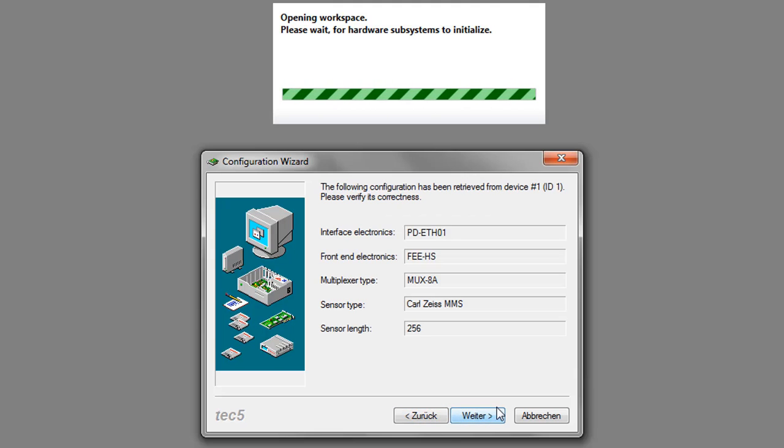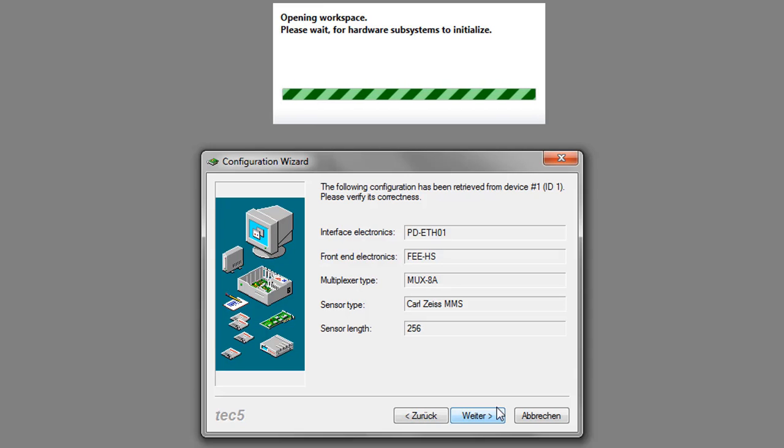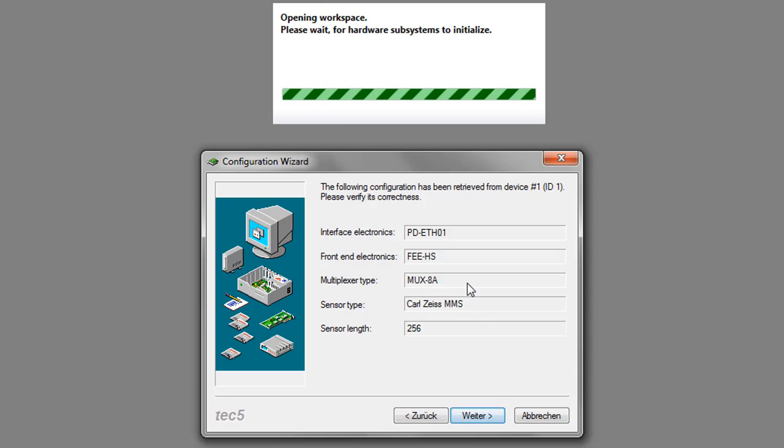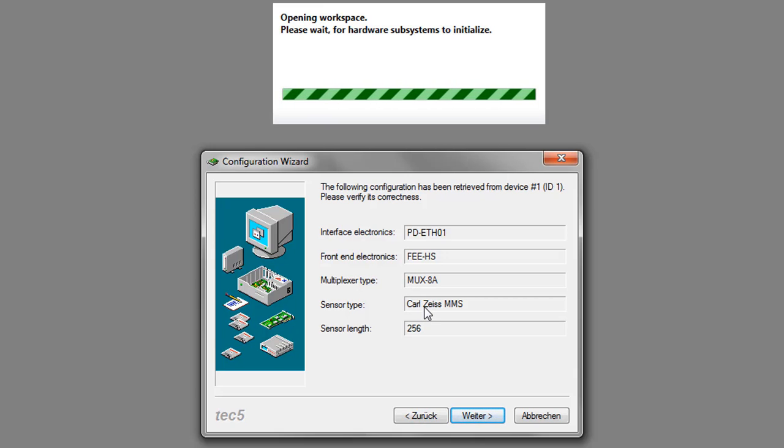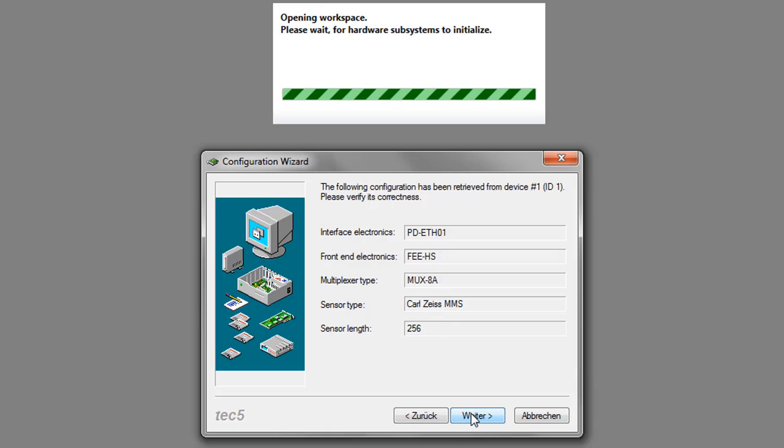The configuration acquires some information on the system. It shows you that the system has a multiplexer and a Carl Zeiss MMS.